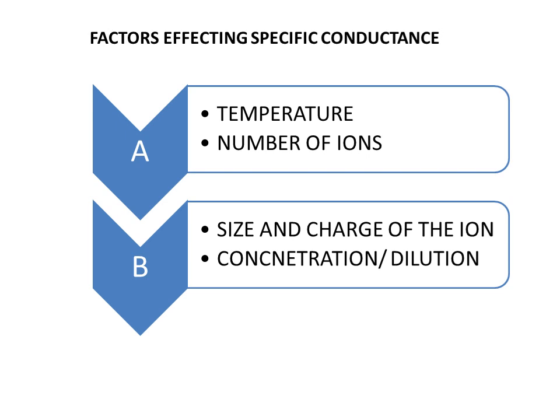What are the factors that influence specific conductance? Here are temperature, number of ions, size and charge of the ion, and concentration, otherwise dilution. I discuss all these concepts again in that video, electrochemistry part 1. Please go through, please visit.